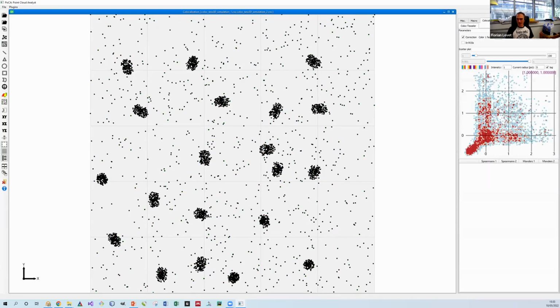Now you have a colocalization tab here, and you can see the scatter plot, and you can apply a factor, and it will compute the Spearman. I didn't explain Spearman, but it's basically just applying a Spearman rank correlation on all the localizations of your data. So there is no threshold applied here. It's really the correlation between all the localizations in the 2 colors. And here there is a Manders where I applied this thing. So you also have access to Colloc Tesseler.